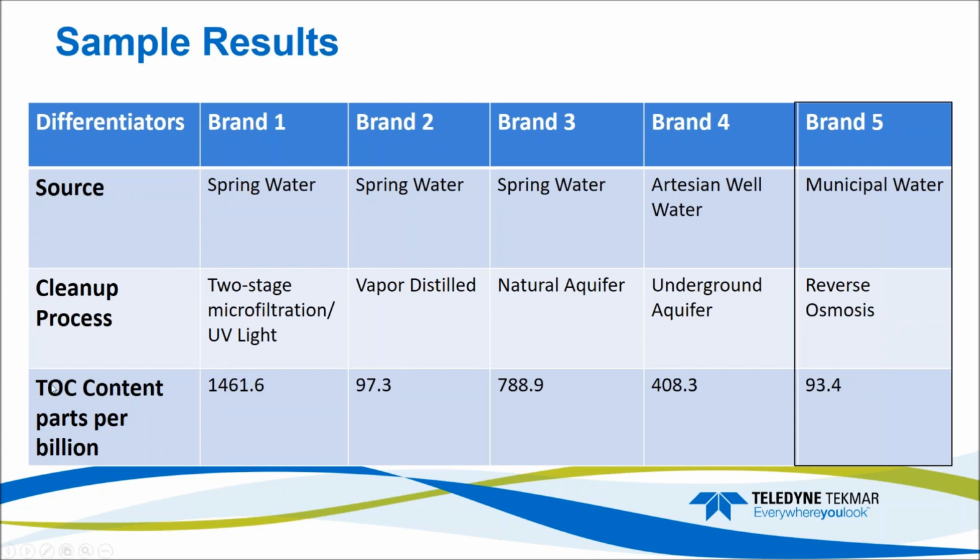Okay, so the spring water with the 2-stage microfiltration and UV light process, you could conclude for this very sample, was the worst. It had the most TOC.